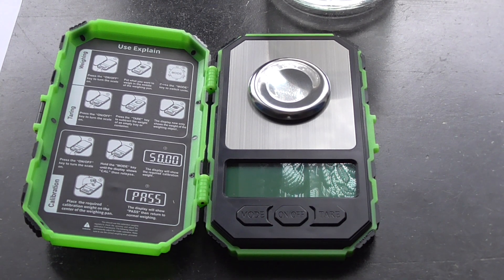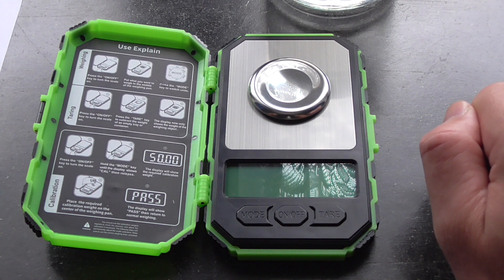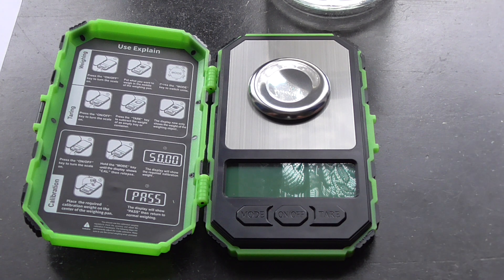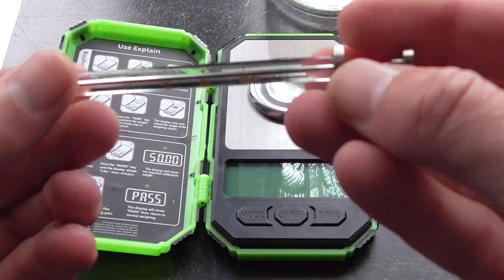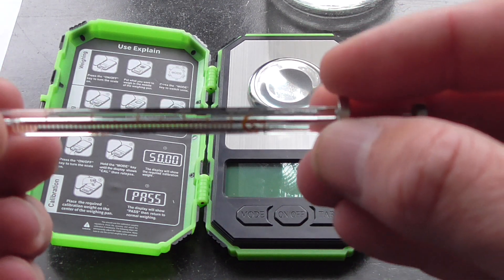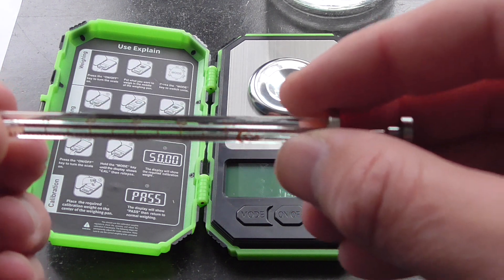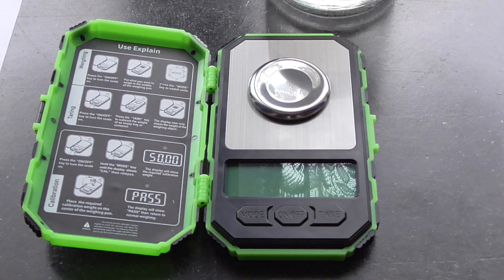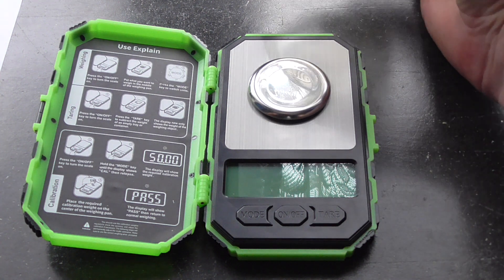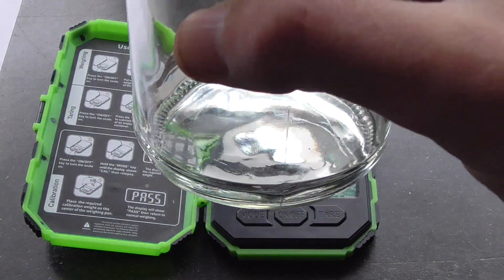Hi guys, today I want to test my new mini scale which is said to have an accuracy of 1 milligram. For this purpose I want to use this syringe which has a scale of 50 microliters. 1 microliter is roughly 1 milligram of water, so it's quite useful to measure the accuracy with this distilled water.